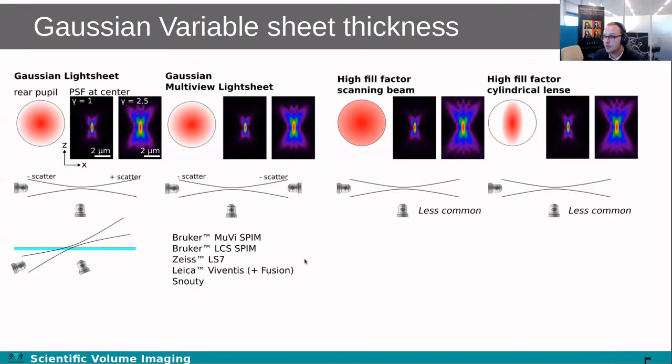Most commercial systems nowadays have multiple illuminations. So you'll find a lot of different commercial systems in this category, and we've experienced very many of them. Also, you'll often find this in a configuration where the objectives are oblique with respect to the cover slip, in which case you additionally need de-skewing as well.